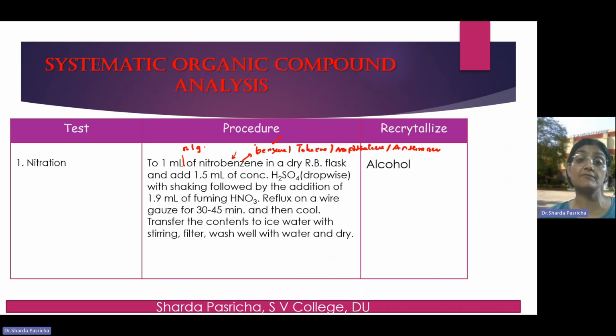Then once you have confirmed that the reaction is over, you can cool the contents, transfer the contents to about 50 ml of ice cold water with stirring, filter, wash well with water and dry, and recrystallize a portion of the sample with alcohol.